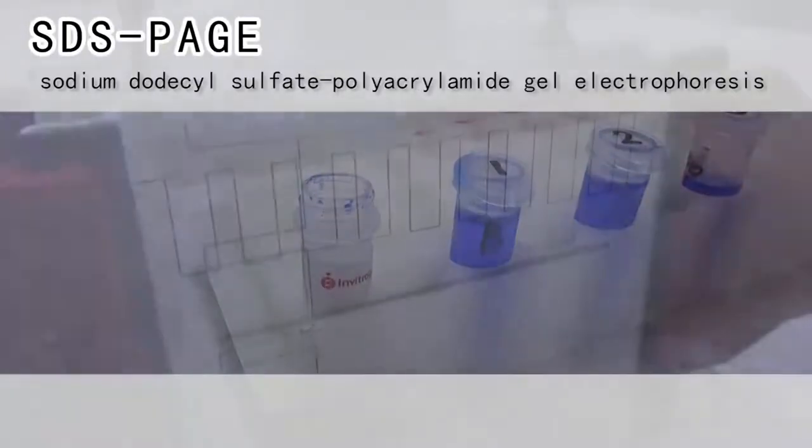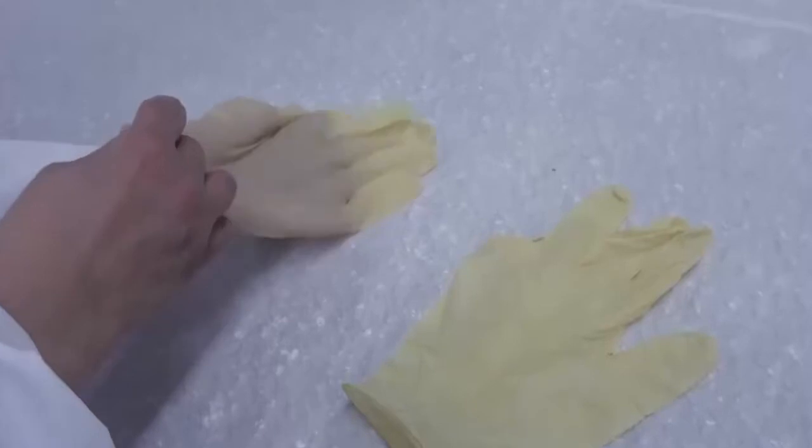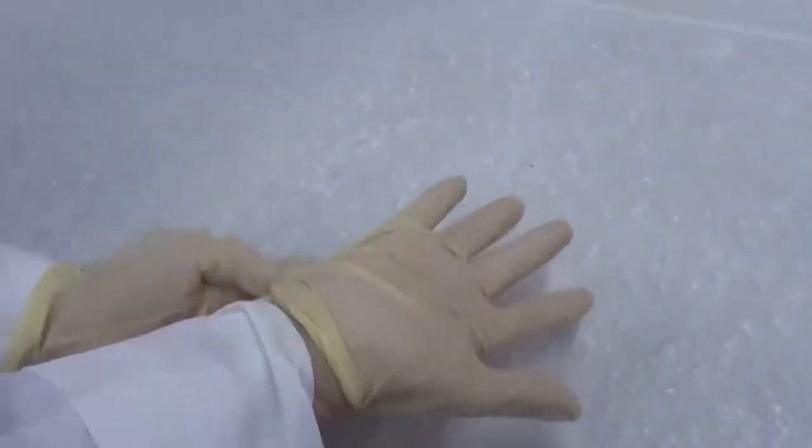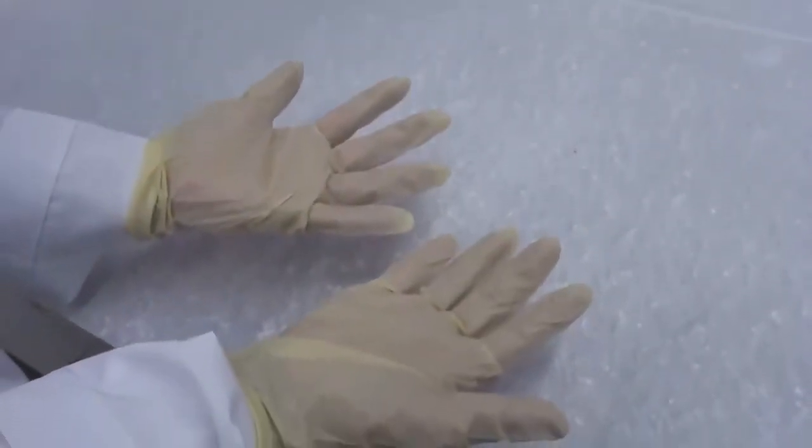Now I will demonstrate the general protocol for SDS-PAGE. Acrylamide is a neurotoxin. Be sure to wear gloves for the entire procedure. Protect any wound from contacting with acrylamide.